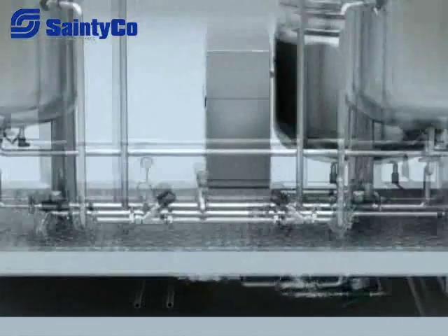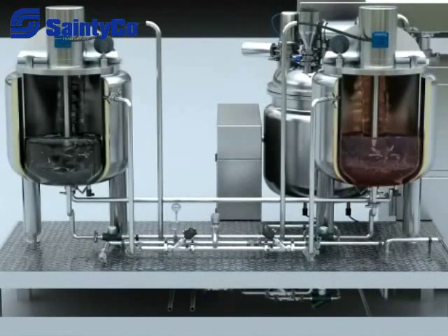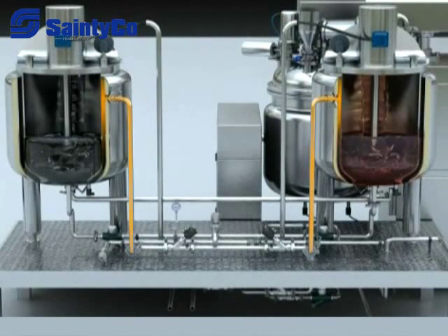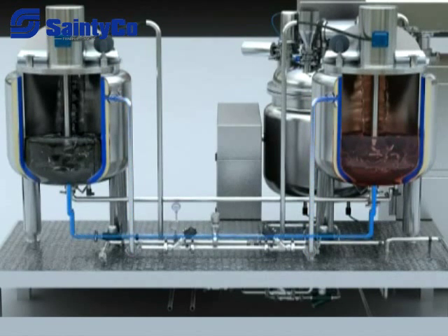6. Pipeline control system. It is made up of high-pressure stainless steel tube, safety valve, manometer, pneumatic valve, and bleeder. When steam and compressed air are normal, if the tank is heated, the condensed water will be discharged from the bleeder after going through the pipeline, valve, and jackets of the tank. If the tank is cooled, the cooled water will be discharged by the discharge outlet after going through the pipeline, valves, and lower hole of the jacket. When discharging water, compressed air enters from the jacket of the tank and pushes the water out. Heat, cold, and discharge functions cannot operate at the same time — only one function can be processed at a time.